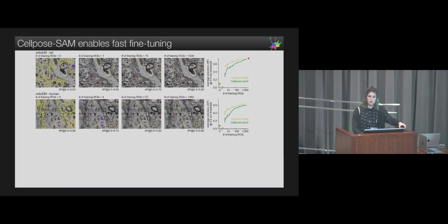In this case, it never reaches the same performance as Cellpose-SAM. And it's also going up substantially slower. So it's going to be slower for you to do human in the loop here than if you're using Cellpose-SAM. And the training of Cellpose-SAM is similar to the training time with Cellpose 3, or faster, because we use fewer epochs for training, fewer iterations. So this is all doable, basically, human in the loop, like if any of you have used Cellpose 2 before for human in the loop.